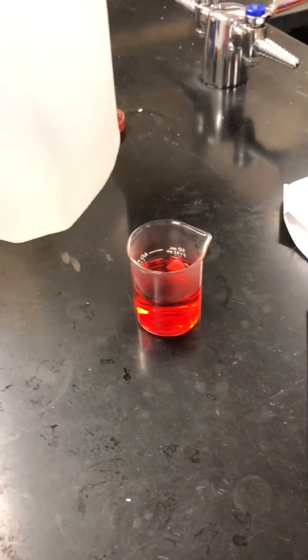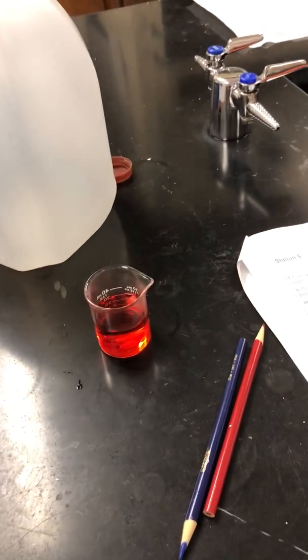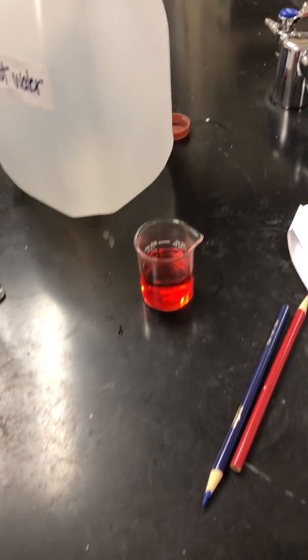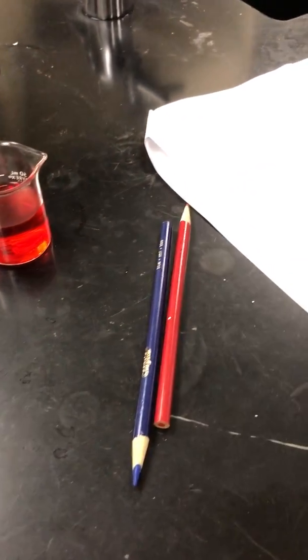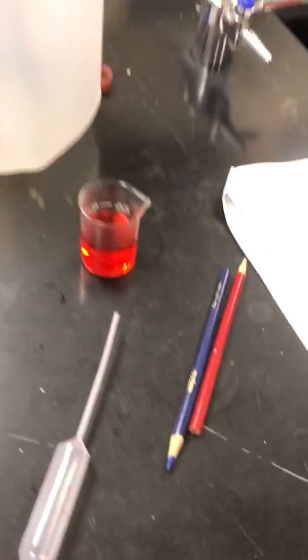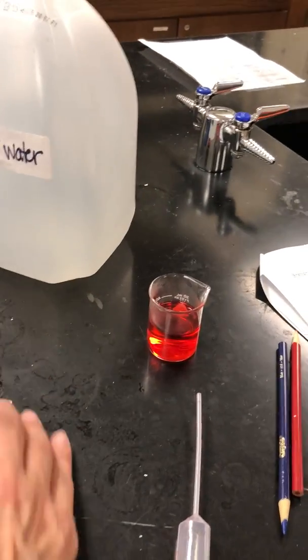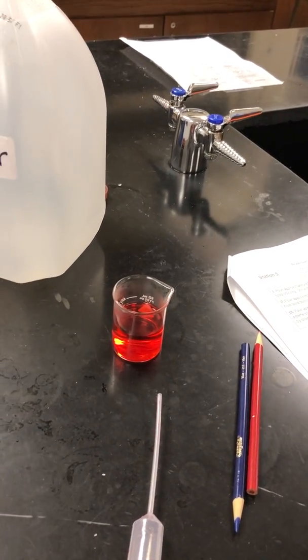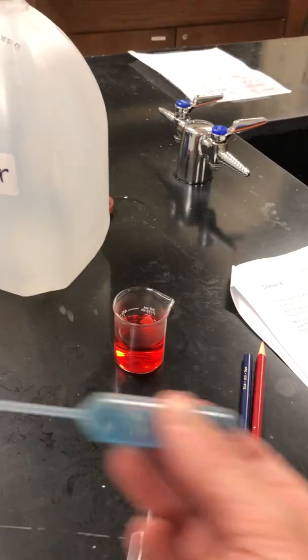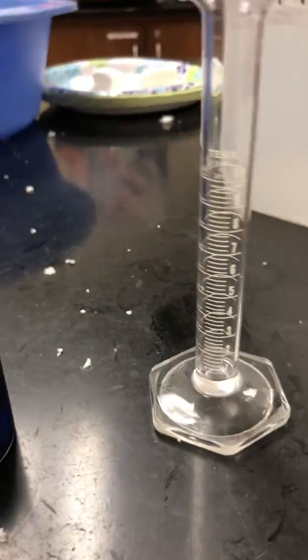Now guys, I did something I should not have done. I touched the hot beaker, and we tell y'all not to, and that's because we don't want you to get hurt. I was willing to take the risk, but please do not do that. Really, if I had my students in here, they'd be all over me on that. Miss Drury, sorry, not in a hurry. But that's what happens when you get in a hurry. You burn your fingers, and yes, they hurt right now. So I will suffer because of my lack of safety.